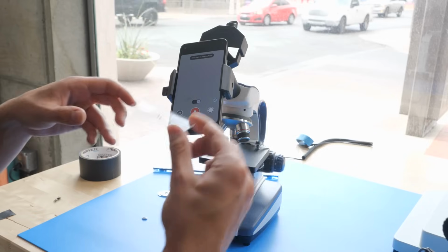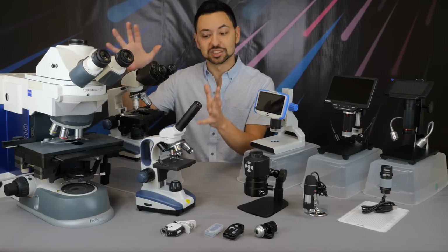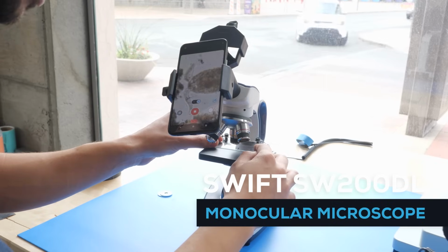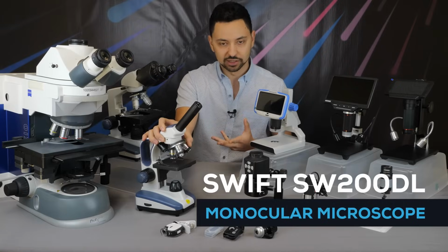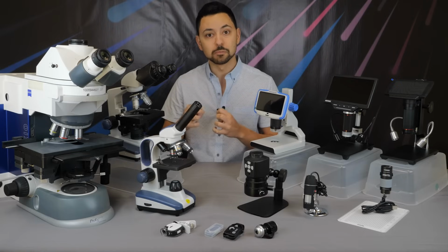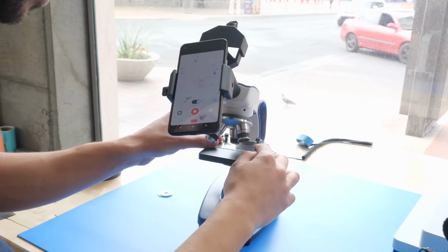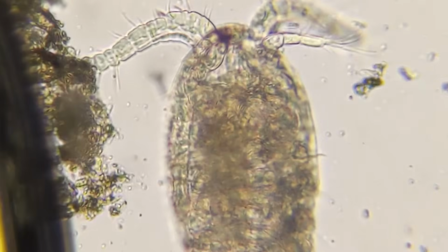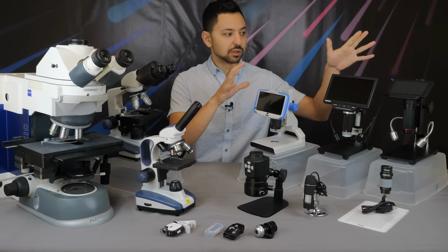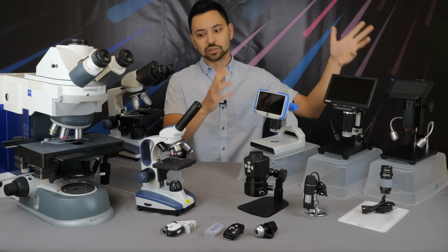What's that? You really want to look at pond water samples and tardigrades under the microscope? Okay, I get it. For that kind of thing, you definitely need to start looking at these compound light microscopes. Specifically, the defining feature of these is that they have these multiple objectives here that have varying magnification levels, and they are typically transmitted light illumination, which is very important for samples that are extremely small and also extremely transparent. So a water bear, for example, is an extremely small organism and it is completely invisible if you're not using transmitted light. So even if one of these microscopes could zoom in enough to see them, you wouldn't necessarily even be able to see it at all because they're so transparent.